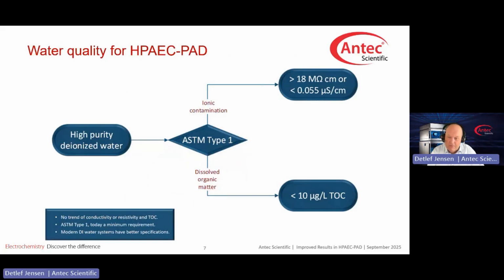Now, you might have laughed about the pictures of superheroes and supervillains, which I intentionally created with the help of AI, because deionized water is still one of the most underrated and undervalued chemicals in our laboratories. Your laboratory's DI water system should be regarded as an asset, carefully protected and properly maintained, since it produces this highly valuable chemical called DI water. Have you ever thought about DI water as a chemical? If you start thinking about that as a chemical, it changes everything.